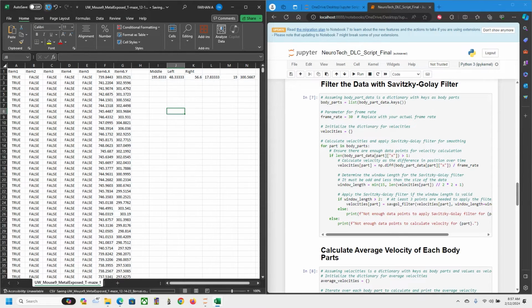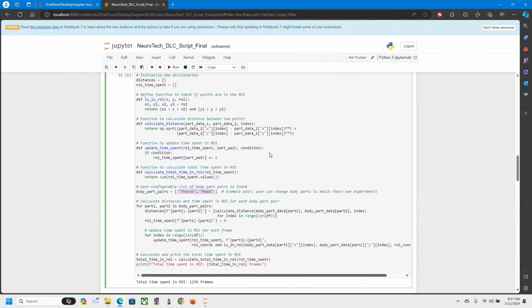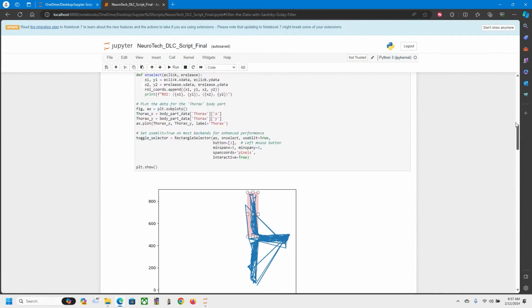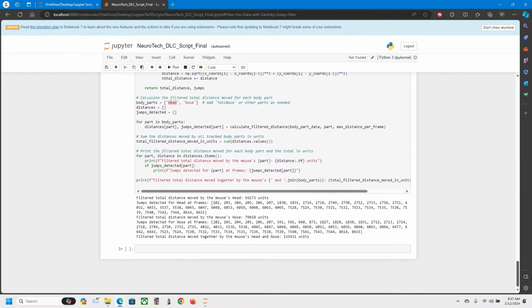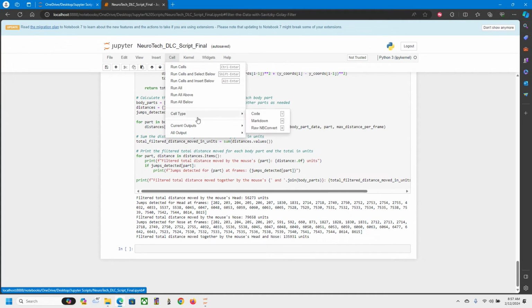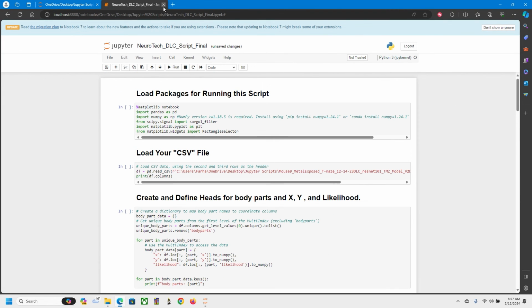So based on whichever analysis scheme you need to use, you now have the capacity to analyze your DeepLabCut outputs through this script, which makes it relatively easy. And if not, always go check out my Bonsai videos to learn how to do analysis with Bonsai.